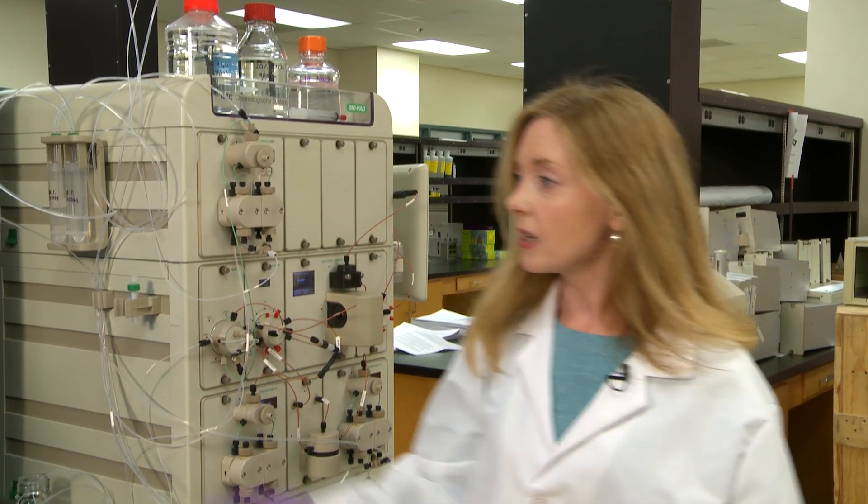Tip two: piston washing solution. Here it is on the side of the instrument — 20% ethanol. You should check it every day, make sure it's not running low, and check for signs of bacterial growth. And if you see anything, replace the solution.